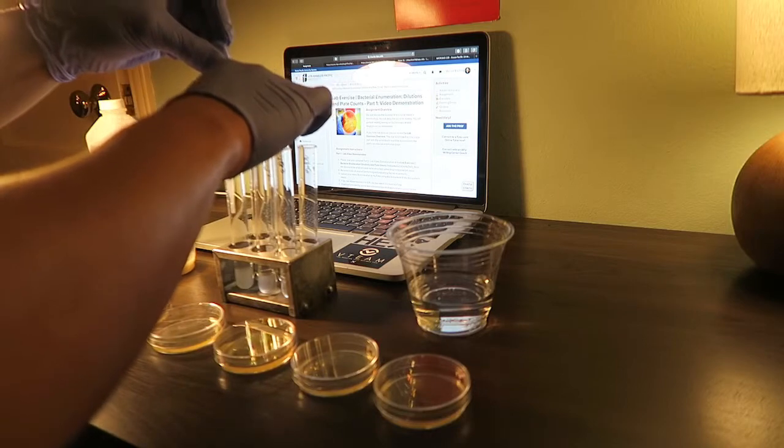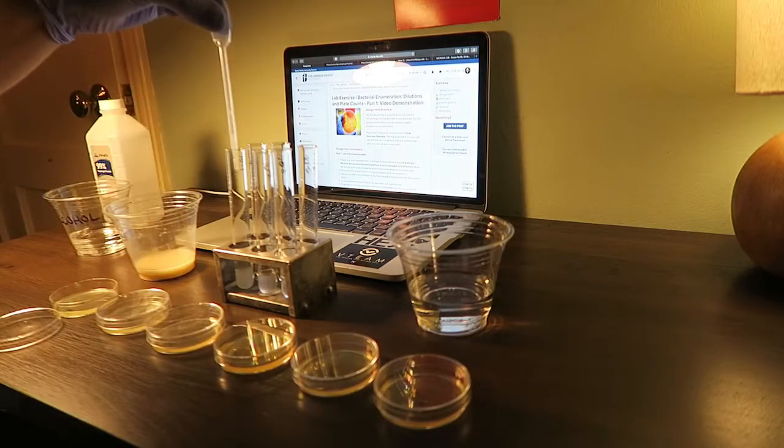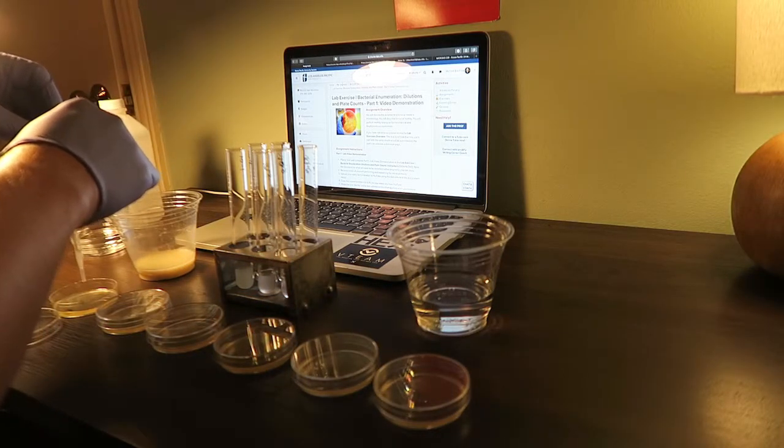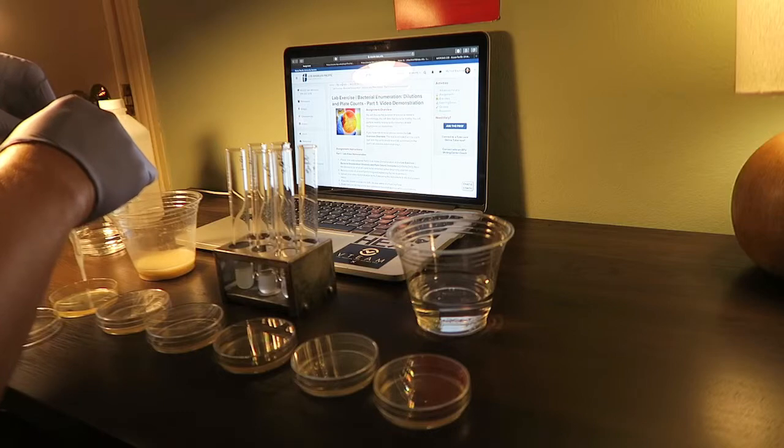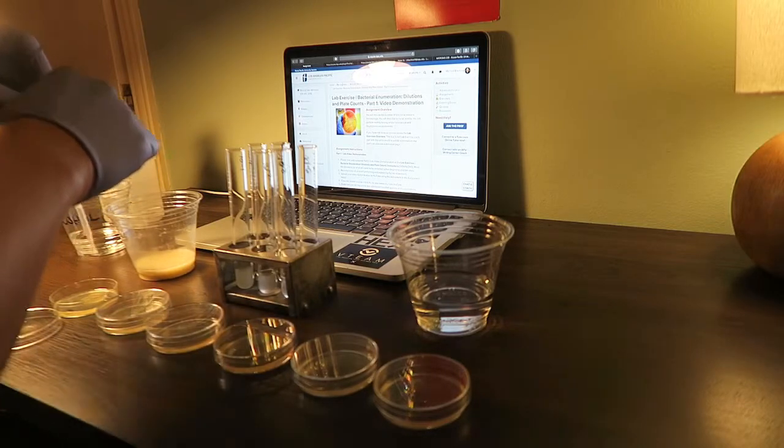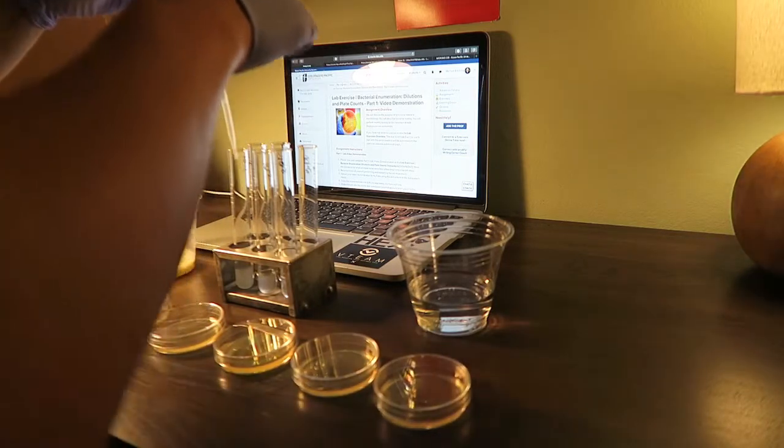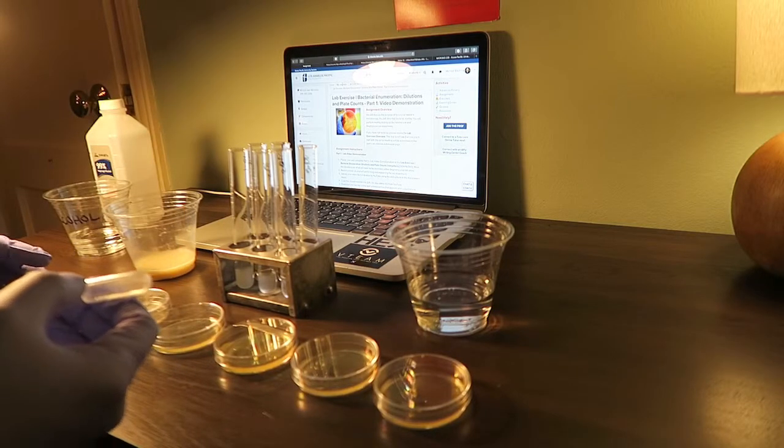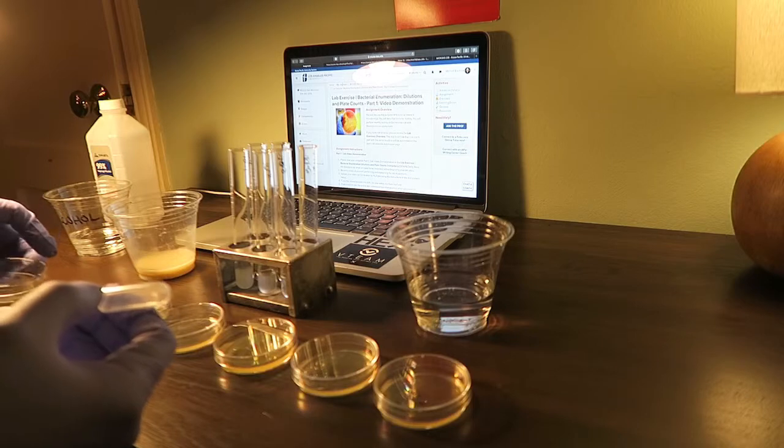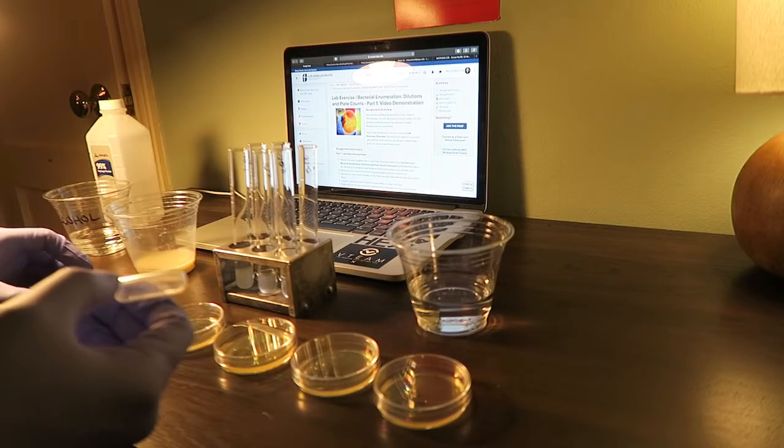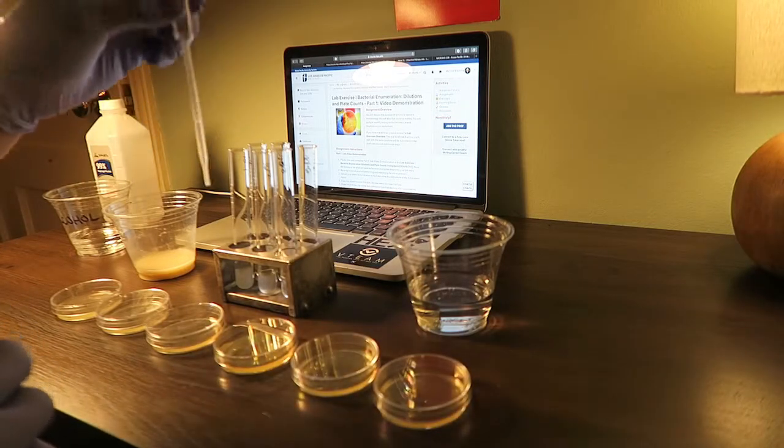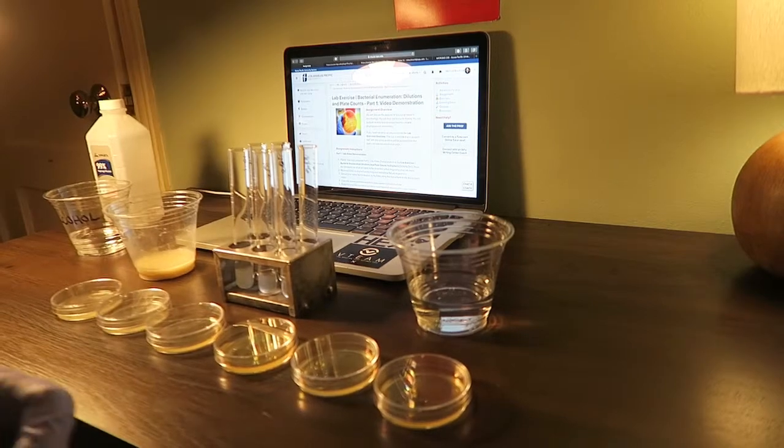We are going to do four drops, or 0.25 ml, into the inoculating plates. So, one, two, three, four. Then recap that and roll it around so it's all spread out. And I'll continue to do that for each tube, corresponding to each plate.